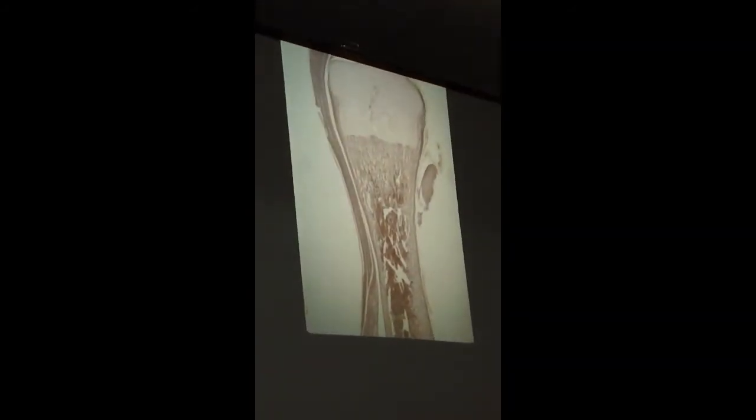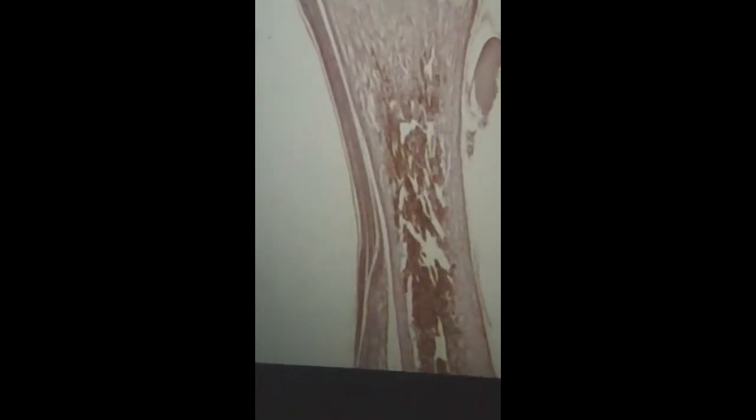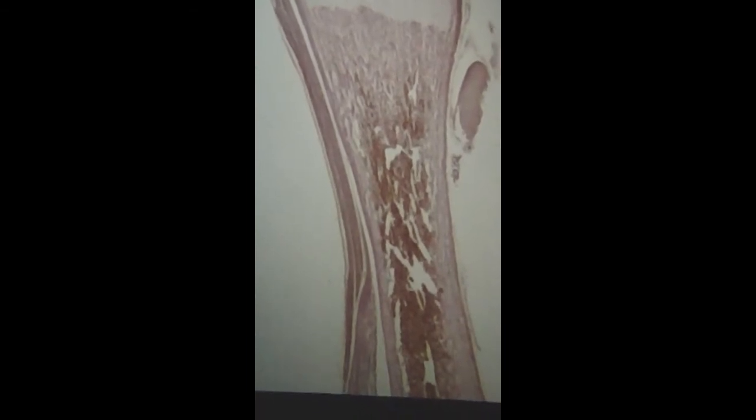In contrast, most of the rest of the bones of our skeleton are formed by endochondral ossification. Here we can see some embryonic bone. We've got the epiphysis, this funnel-shaped region that supports the head, the metaphysis, and then the shaft down here. You can see that this marrow cavity has been hollowed out as you get down towards the diaphysis, the shaft of the long bone. But up in here, we've got a bunch of spongy bone, or trabecular bone, all right?